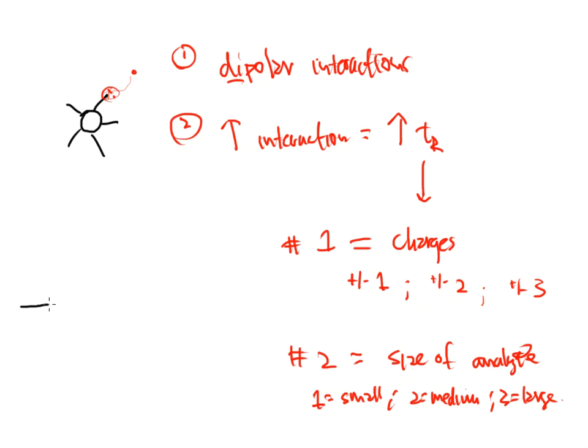Let's say that we get a chromatogram and we get something that looks like this. And let's say that I have injected fluoride, bromide, and chloride into the system. And I've been lazy and I have not injected standards to get retention times. And I should be, right?